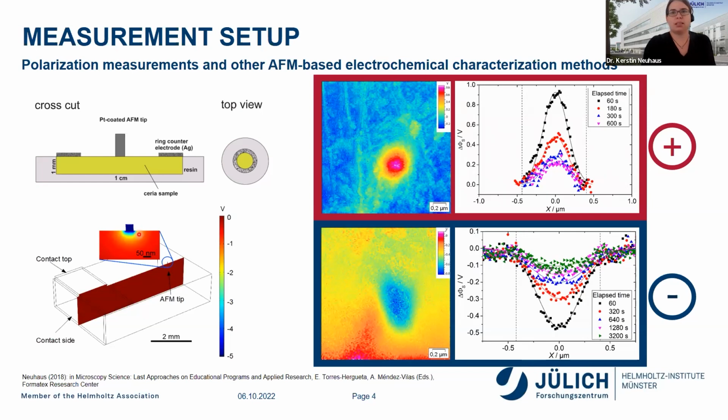So this is a huge advantage of this technique, because we can actually see the shape of the introduced gradient. And we can see whether it is isotropic, like here in the image above, or if there is a slight anisotropy, like shown here. And we can also have a look at how it does behave at grain boundaries. Does it fade gradually, or do we see two different relaxation processes? All this can be monitored, and we couldn't see this if we would polarize the whole sample and then do a set of measurements.